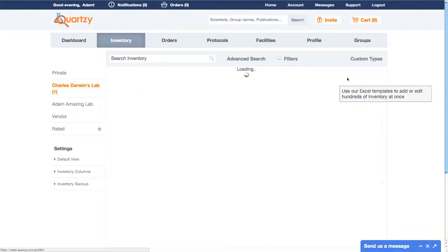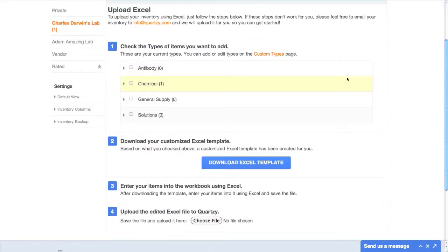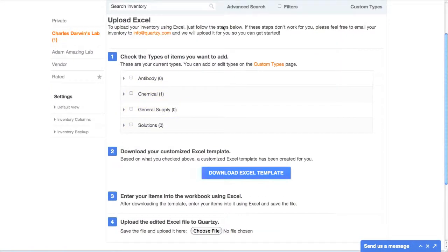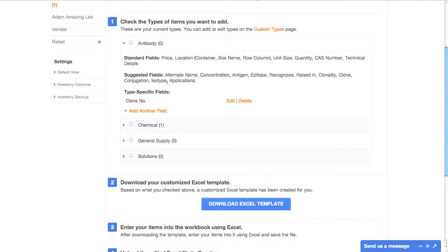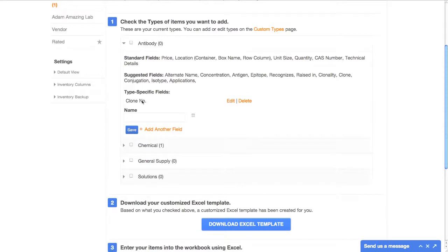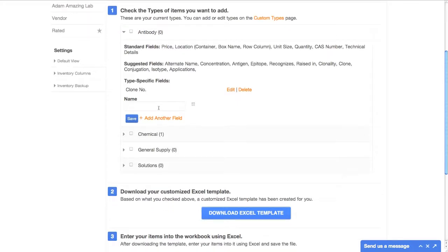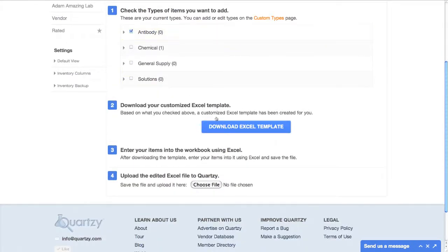Just go to the Add Item page and click the Upload Excel button. The next page will give you detailed instructions on how to get your inventory up onto the site. Let's say I want to upload some antibodies. I can expand the antibody type and make sure all the fields I care about are there — if not, I can add some of my own. I keep track of the clone number for my antibodies, so I'll enter that field to make sure it appears in the Excel template I'm about to download. I'll check off the antibody type and then click Download Excel Template, and Quartsy will shoot an Excel workbook right to my computer.